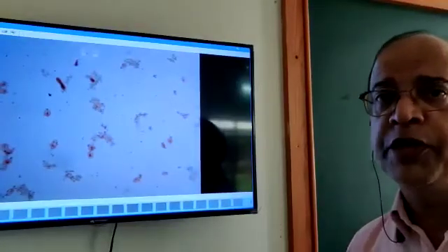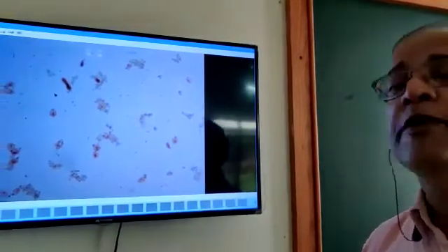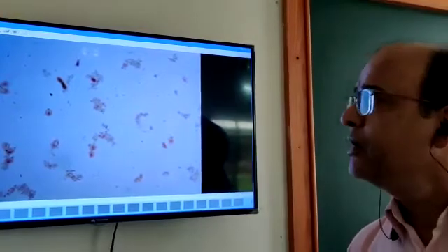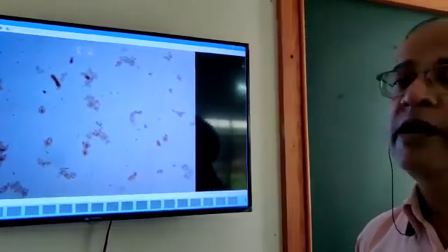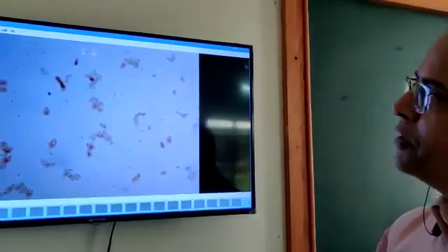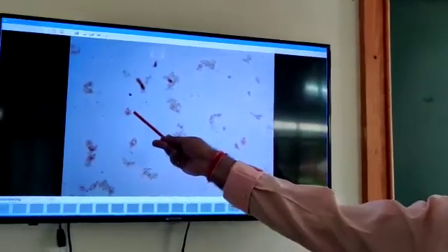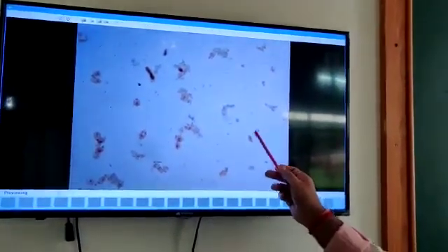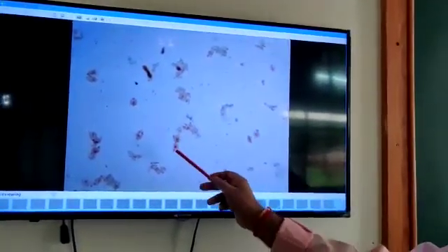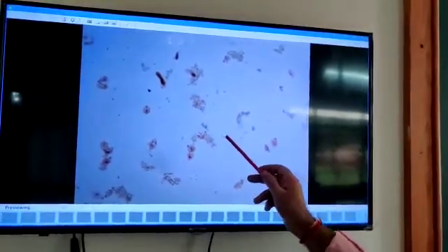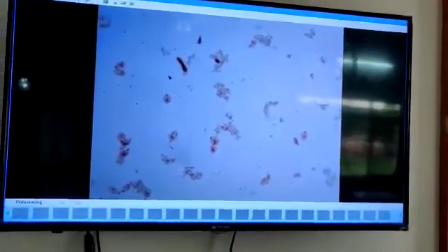I am showing you the permanent slide of a pathogen, and that pathogen is Entamoeba histolytica. These cells are of Entamoeba histolytica. It belongs to kingdom Protista and it causes the disease dysentery in human beings.